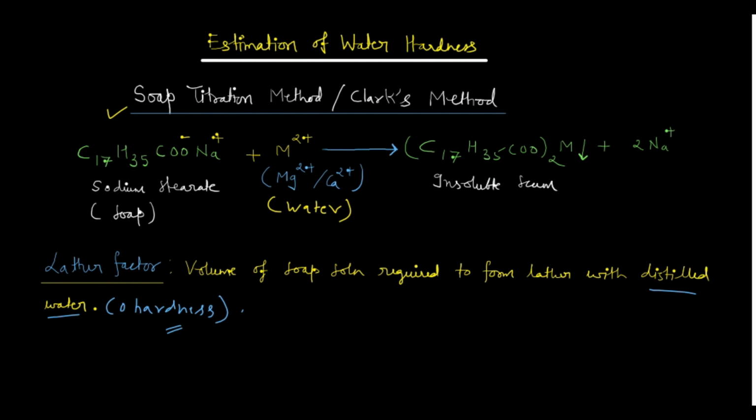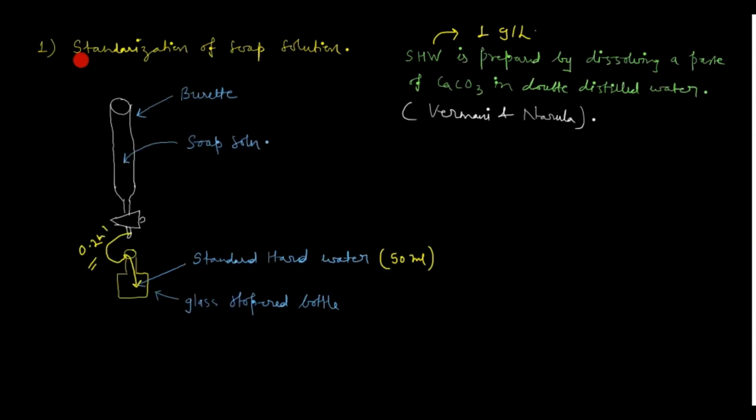Now moving to the next slide. So my first method, see what I am doing. First I am doing the standardization of the soap solution.